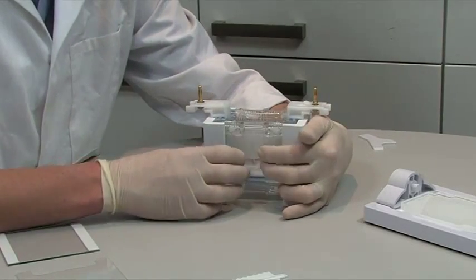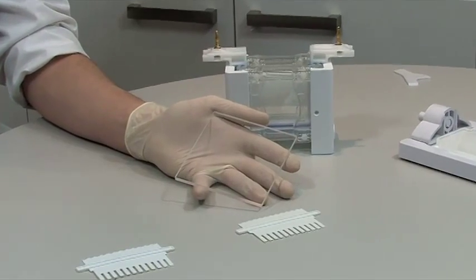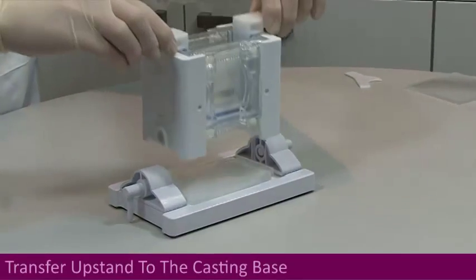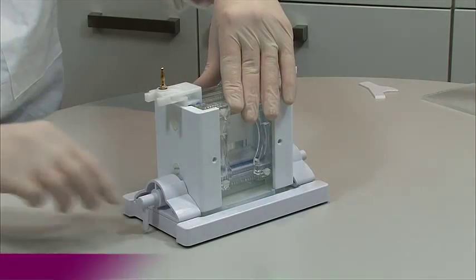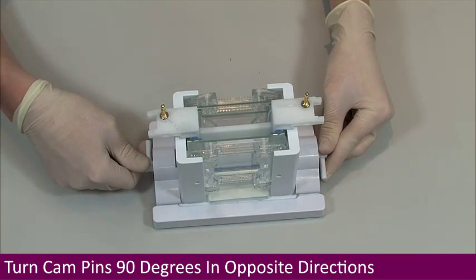Then close the sliding clamps fully. Repeat for the other side. Insert the dummy plate if only casting and running one gel. Pull out the cam pins from the casting base and rotate them so that they point downwards into the bench surface. Transfer the upstand containing glass plates to the casting base, ensuring that the glass plates sit evenly on the ultra soft silicon mat. It may be necessary to apply gentle pressure to the top of the upstand to enable the cams to locate within the upstand.